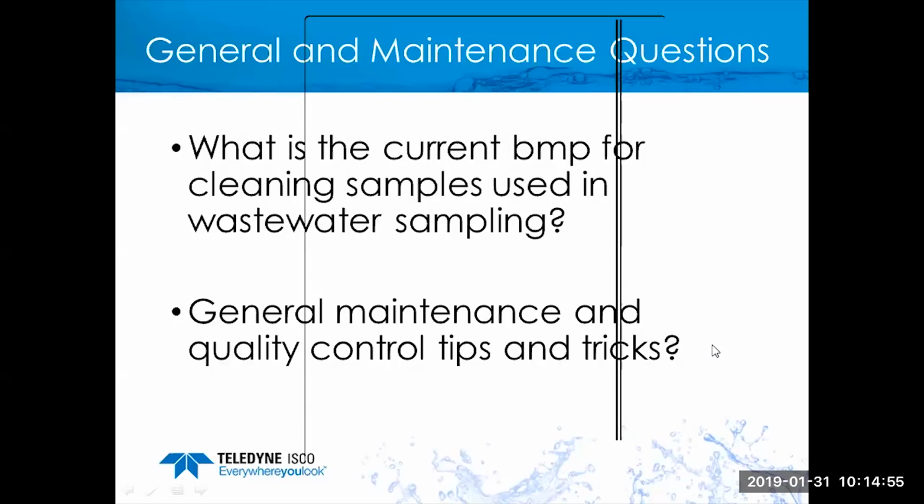The reason for this is if the source is above, the sampler will not be able to freely and fully purge the line clear, and therefore you would have residual samples sitting in the line between sample events that will be degrading if it's exposed to sunlight, high temperatures, whatever. And when the sampler goes to collect the next sample, it is that amount of fluid that's been sitting in the line that will be delivered to the bottle. Again, that breaks the number 1 rule. That sample will not be representative of the source that we're sampling from.